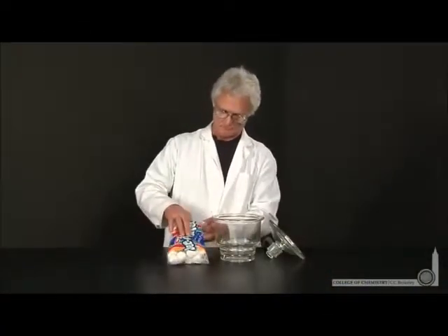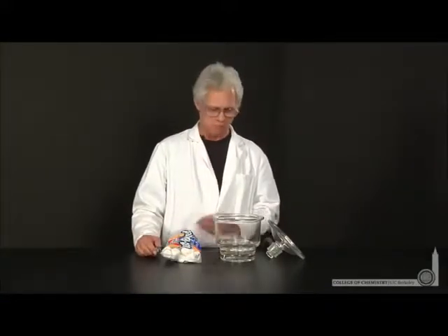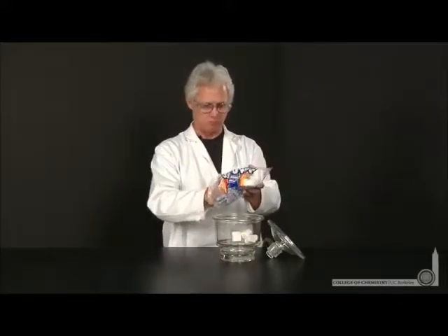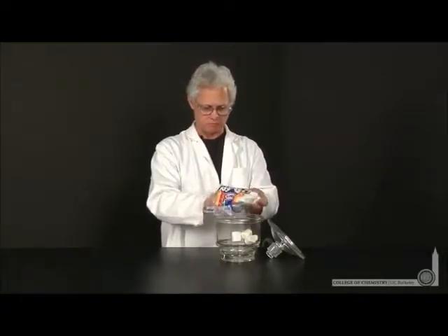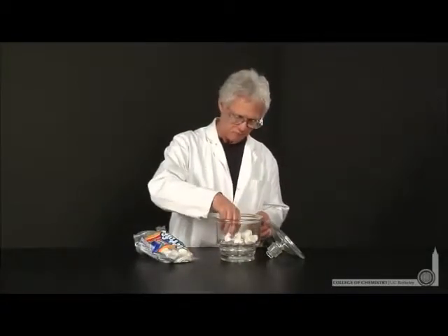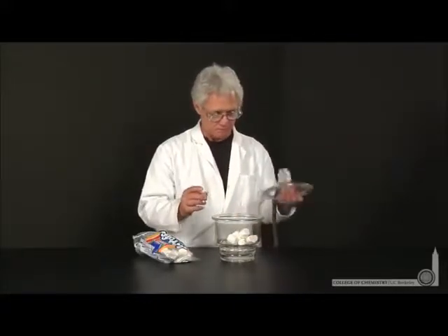We're in the demo lab with Lonnie, and we've asked him to demonstrate the inverse proportionality between pressure and volume. If you decrease pressure, volume would increase. Lonnie's chosen to use marshmallows, which have hundreds of tiny air pockets of fixed volume. He's placing them in a flask where he can remove the air and reduce the pressure. As the pressure reduces, the volume of the air pockets in the marshmallows should increase.